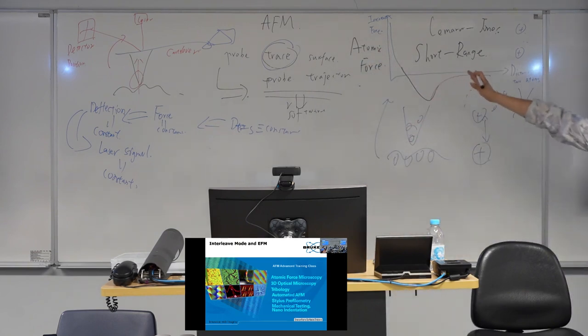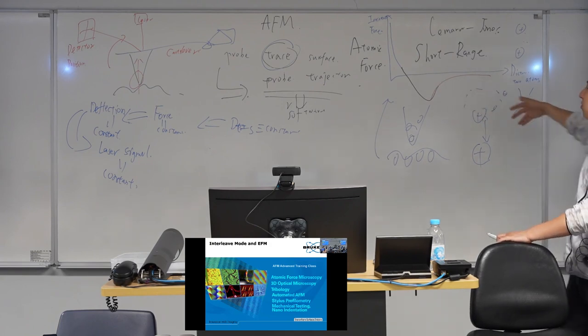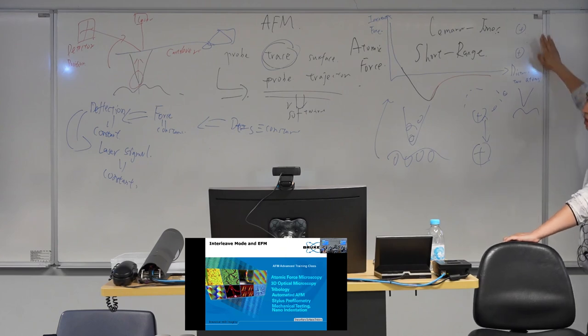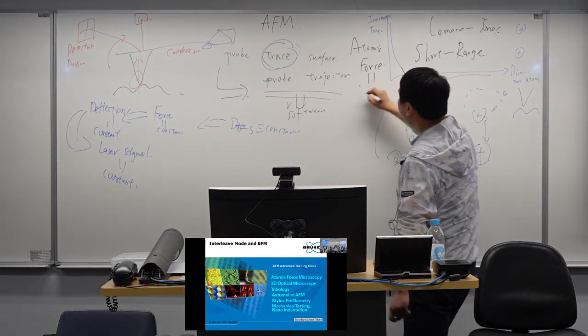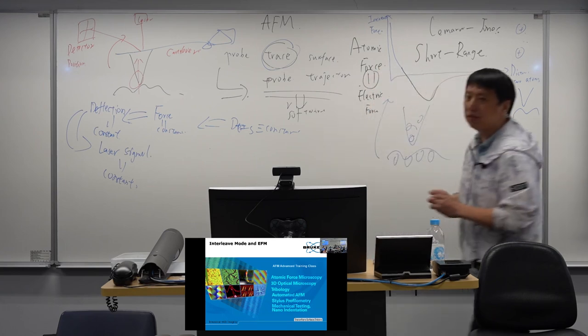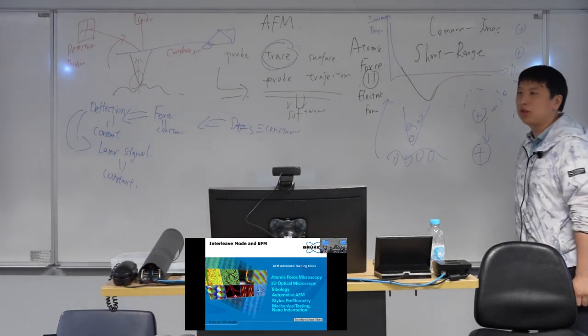In principle, you will know this so-called atomic force is just the electric field force, right? It's just the force between the positive charge and the negative charge, or positive charge and the positive charge. So the atomic force in principle is the electric force. But we will consider it a kind of short range electric force.